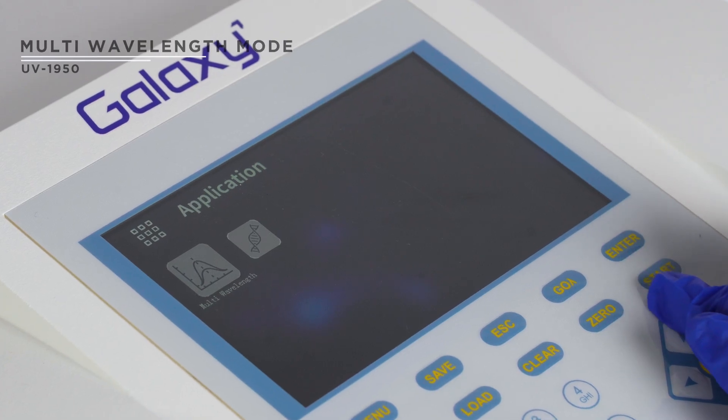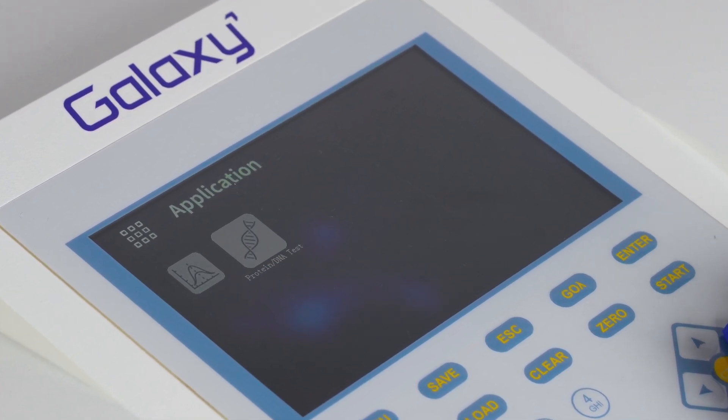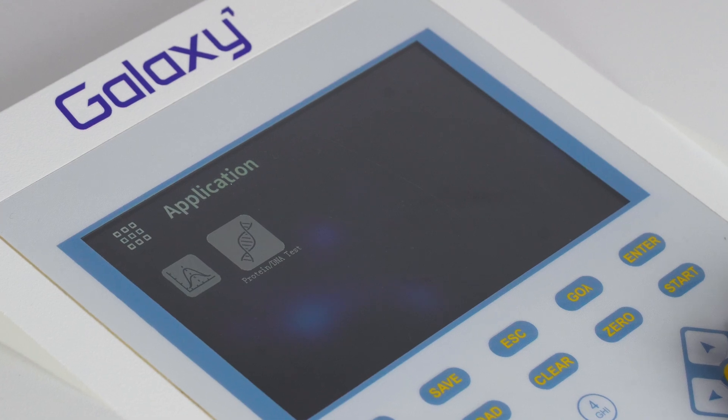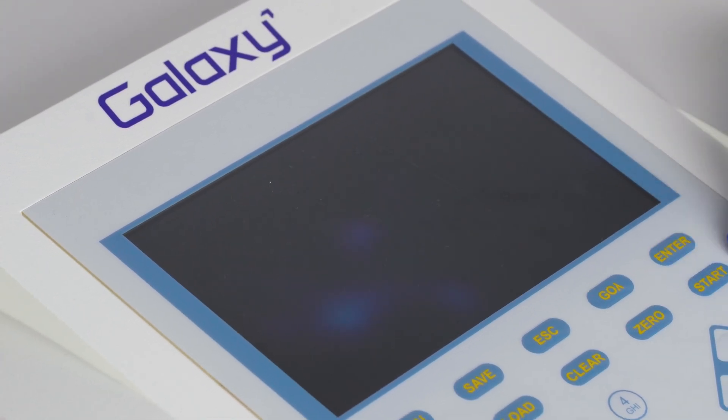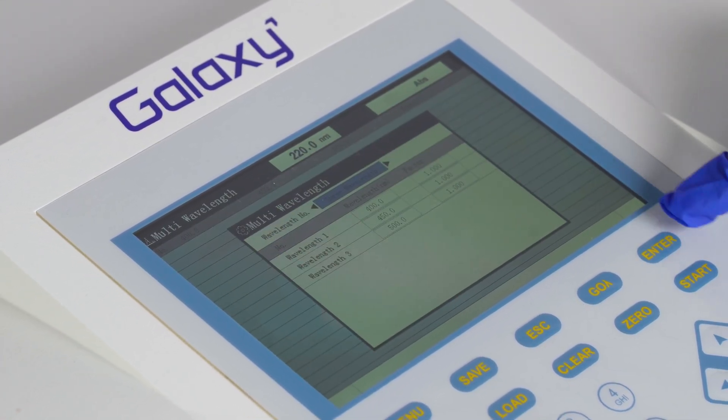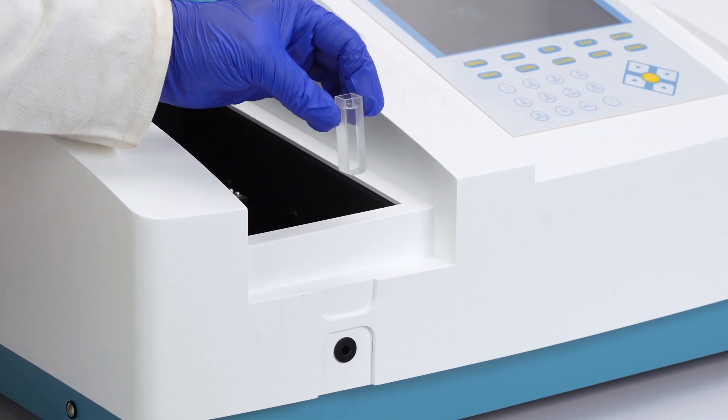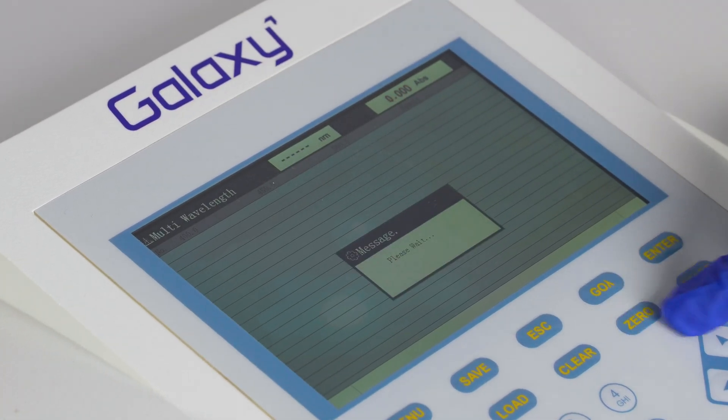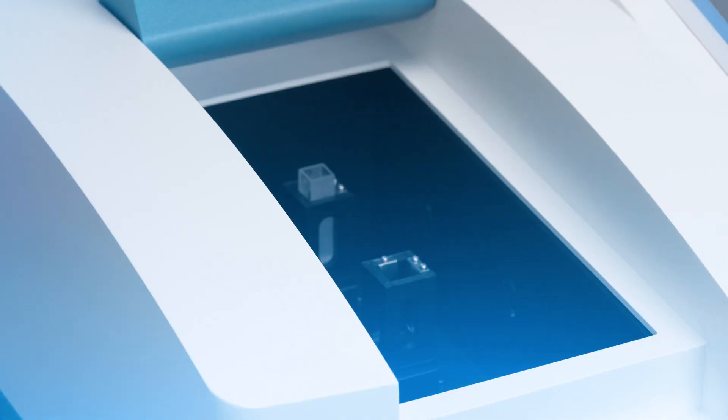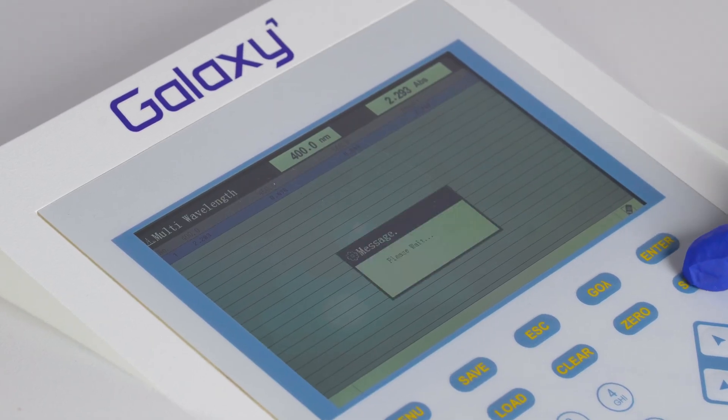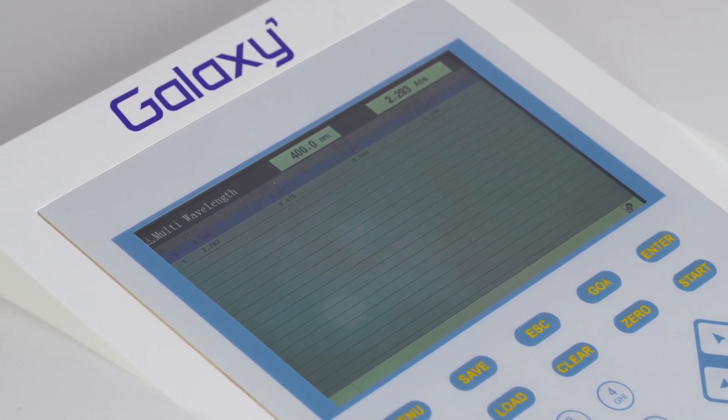The applications menu includes multi-wavelength and DNA and protein analysis. In multi-wavelength, enter the desired wavelengths. Place blanks in both holders and press zero for blanking. Insert the sample and press start to measure readings at multiple wavelengths.